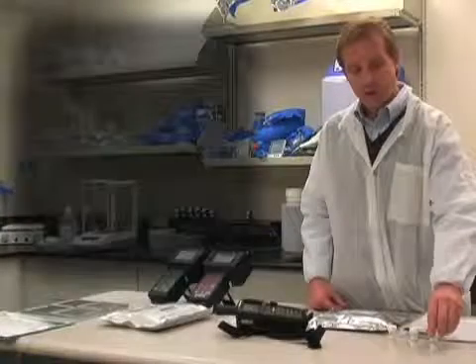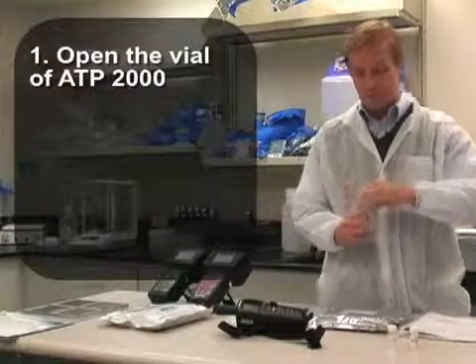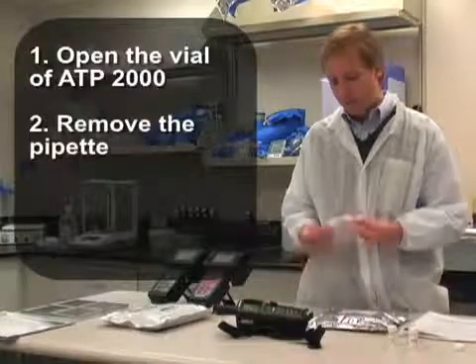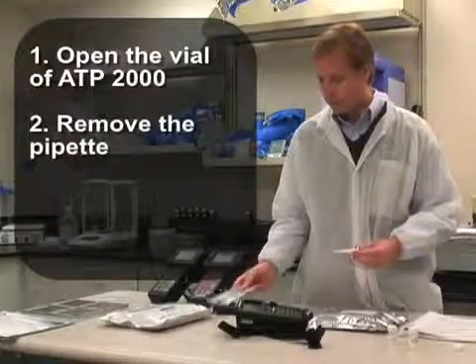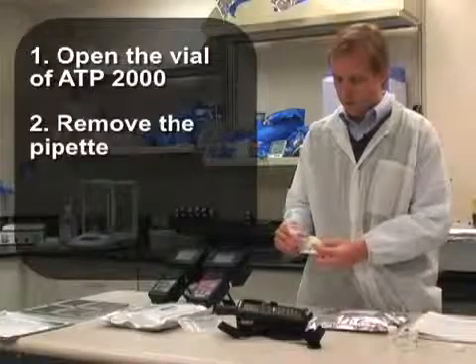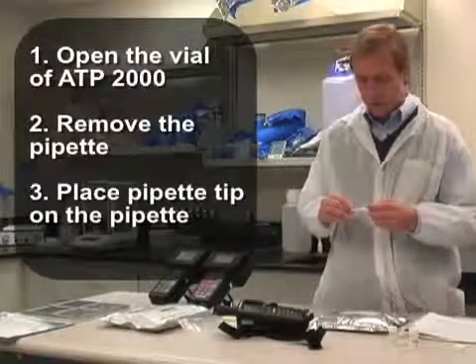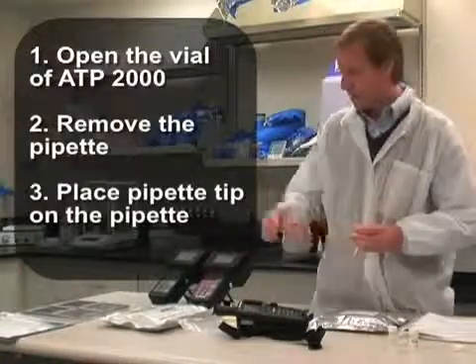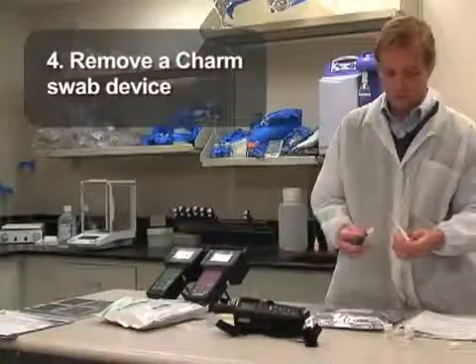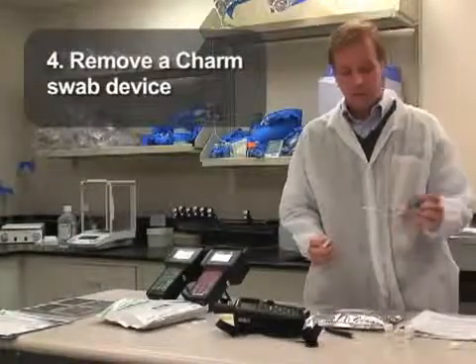Step 1 is to take your 2,000 femtomoles of ATP and open it up. Then you want to remove the 10 microliter pipette. Remove a pipette tip and place it on the pipetter. We then want to remove a Charm pocket swab device. Pull out the Charm swab.